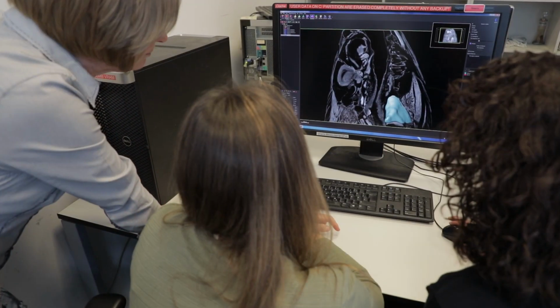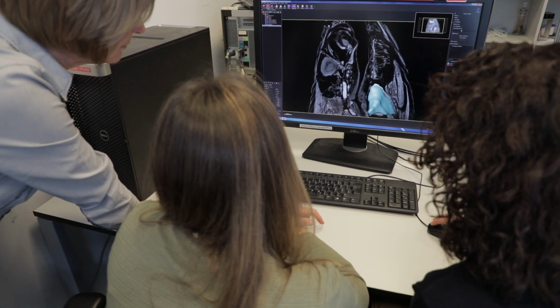In the adult stages, many diseases regarding the heart can be modeled. For example, the cardiac hypertrophy, or another disease that can be modeled is the fibrosis of the heart or different cardiac arrhythmia. And also this can help to understand better how the function of the heart restores after regeneration, so after myocardial infarction or many other different diseases. And for example, what we are trying to understand is if zebrafish can also become a model to model diseases affecting the big arteries.